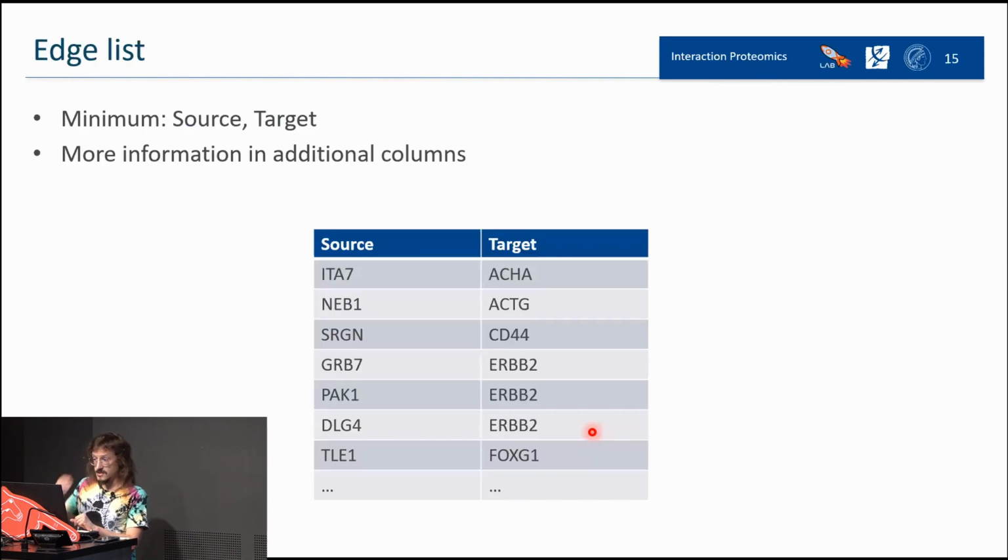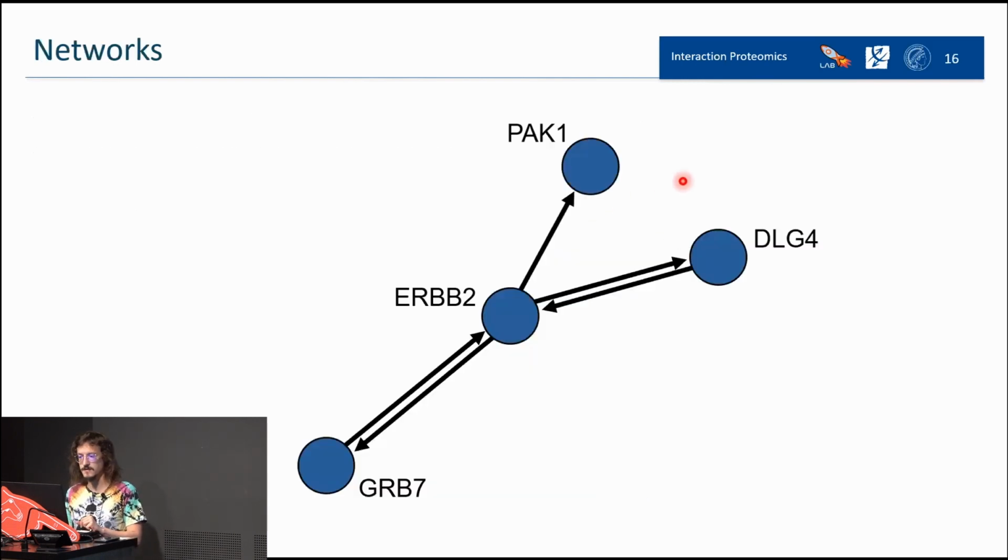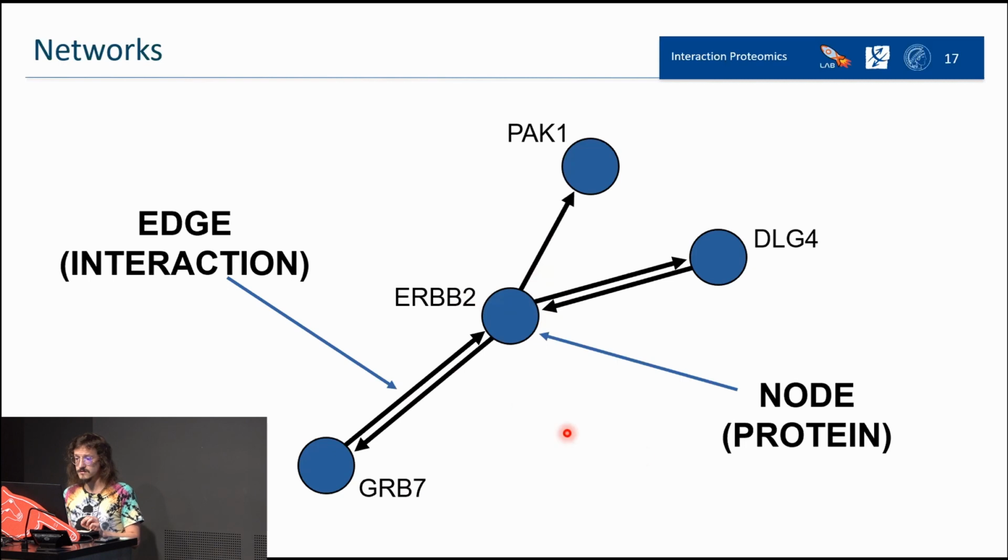So let's start with the edge list. As I said, you just have your source, in this case could be a bait, along with the target, the specific binders. If you want, you can add more information on how significant this interaction was, if there are any other targets also, but it's just a simple table at the end. But it's a kind of boring type of representation, better to go for a network. And from here, you can see this is a very simple network. We have this central part here that we can call a node.